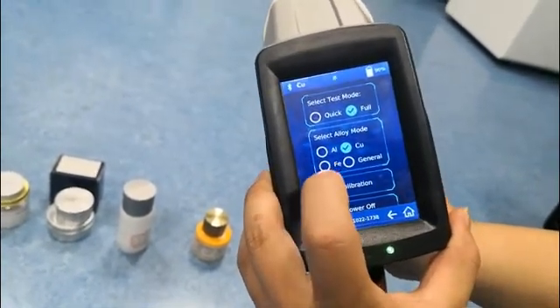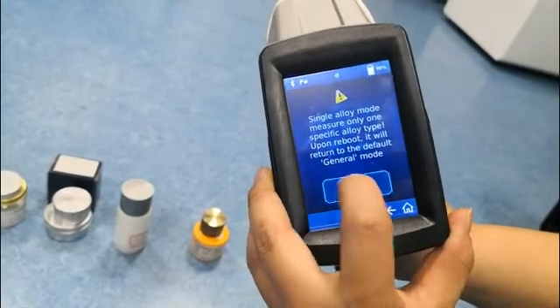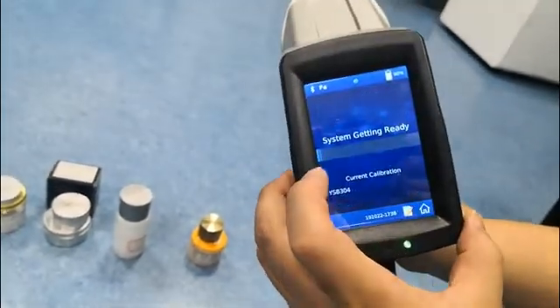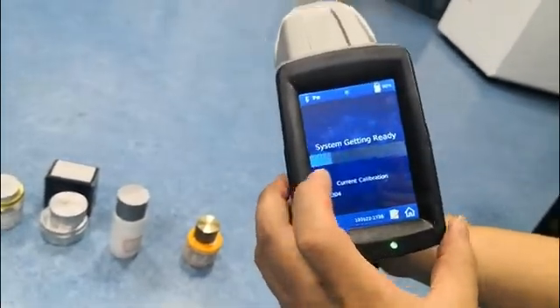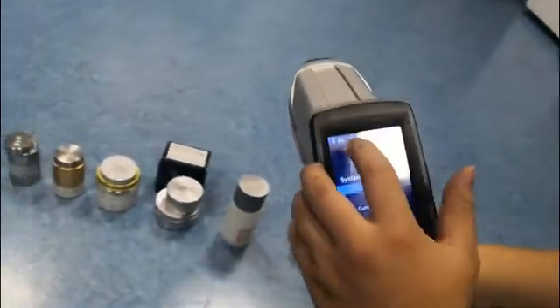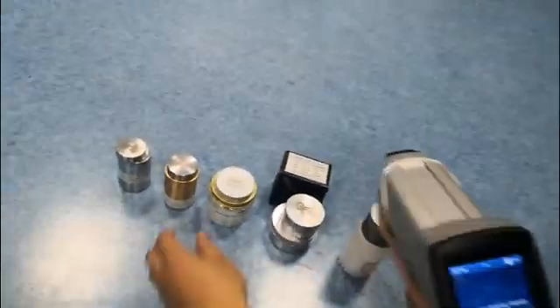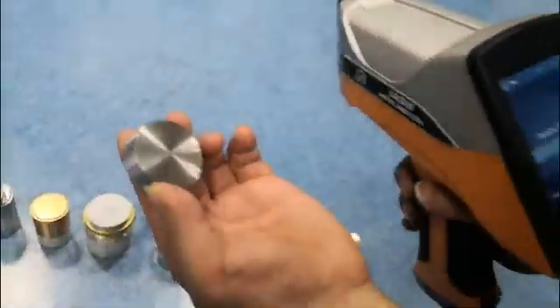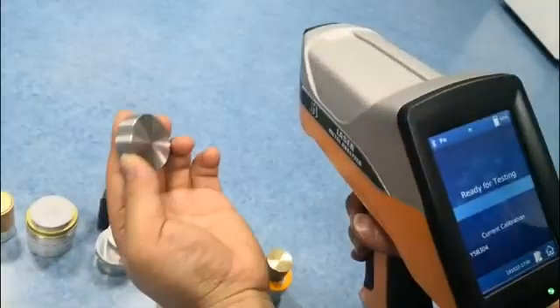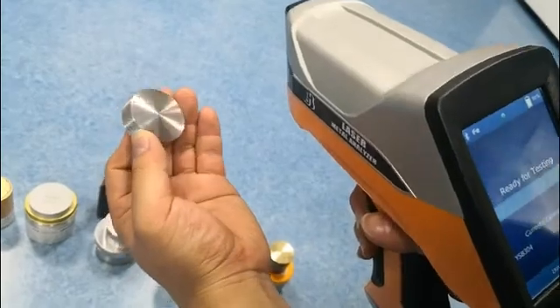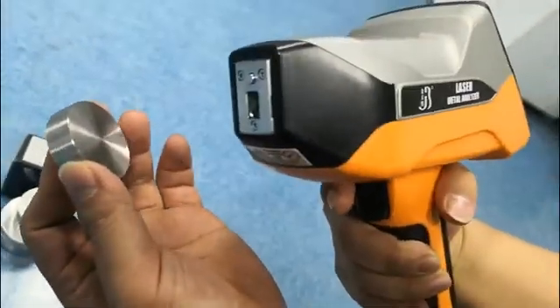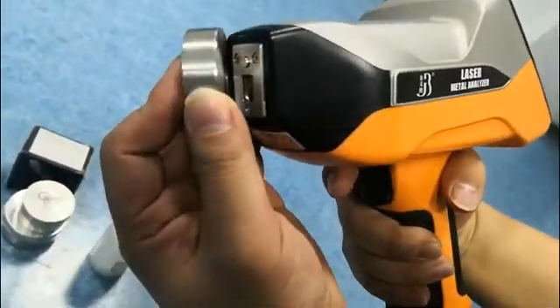Iron base. Testing the iron base here. This is an iron sample, standard steel. We put the sample here.